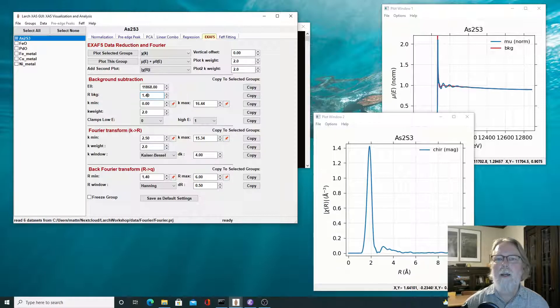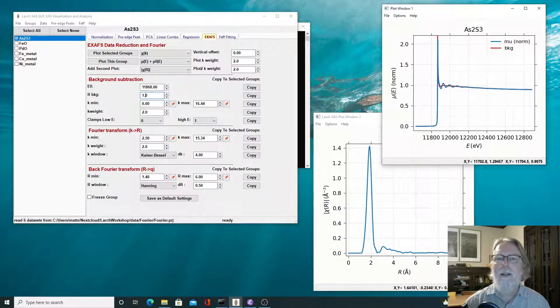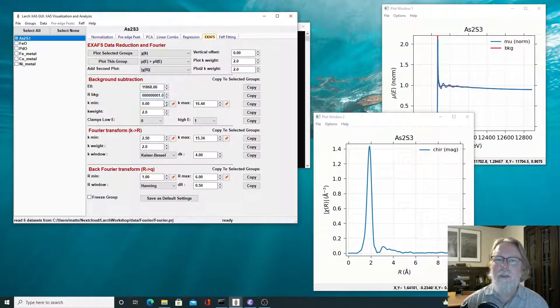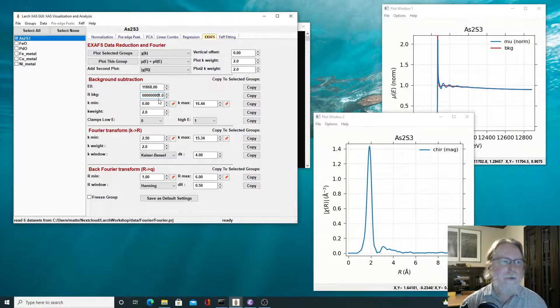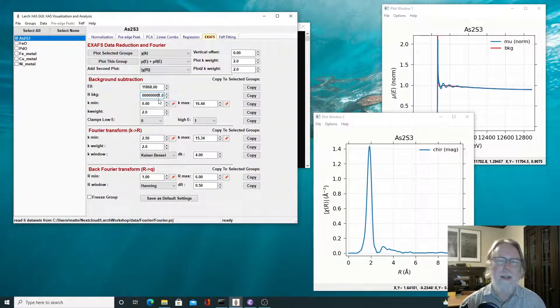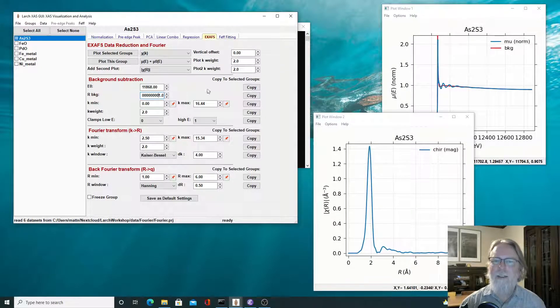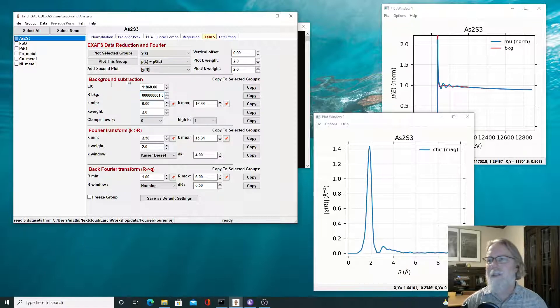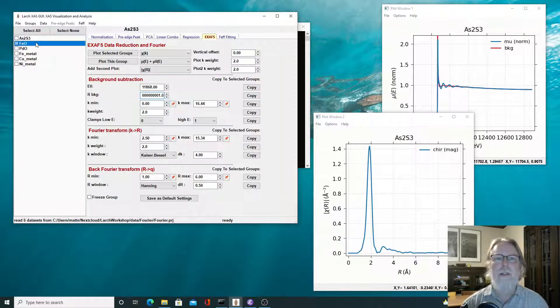And you might start to bleed into that first peak, but you won't do very much damage to it. So in fact, just taking the default value of about one was pretty good. And I would say, it's better to do this step quickly and then assess it later on in further analysis.